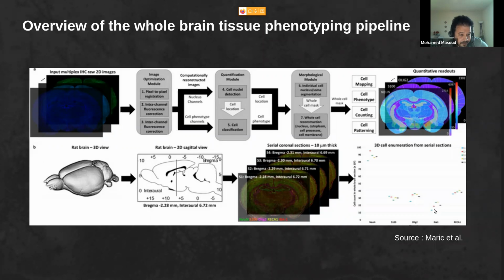I didn't see evidence that they tried another way, because there is a 3D multiplexing imaging, which is a different, more advanced technology. They didn't use it, but they are trying to tell how we can use the whole stack of slices to get more insightful data that contains all the brain cells, as we can see here. This is all that they did with the 3D.